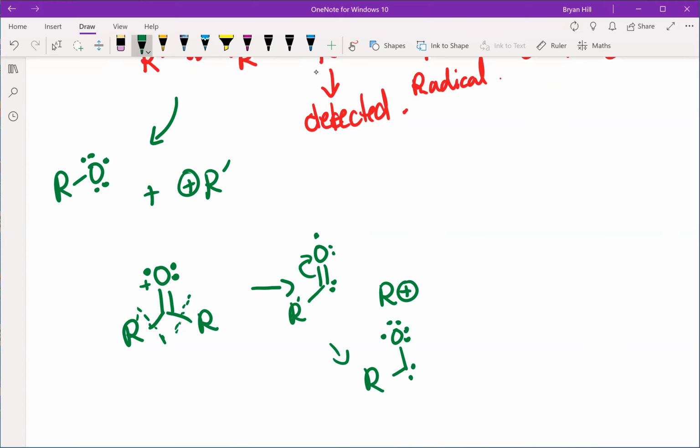And there's no formal charge on this carbon because the carbon's got 4 valence electrons, minus 2 bonds, minus 2 electrons, equals 0. It just looks very, the organic chemist in me hates the way that this thing looks. But anyway, you can break bonds on either side through this inductive cleavage of carbonyls. We've got to find a better way to draw that.